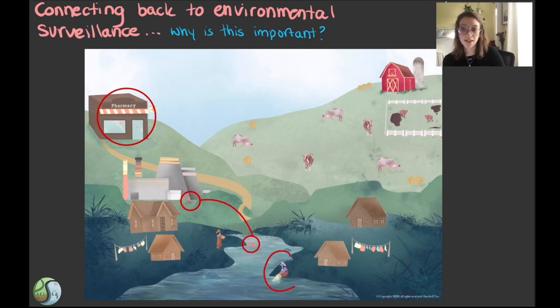Metagenomics and bioinformatics can also help us monitor the presence and abundance of specific types of antibiotic resistance, which provides information on emerging trends and potential human exposure risk. We can then develop interventions that prevent this exposure and reduce antibiotic-resistant infections.